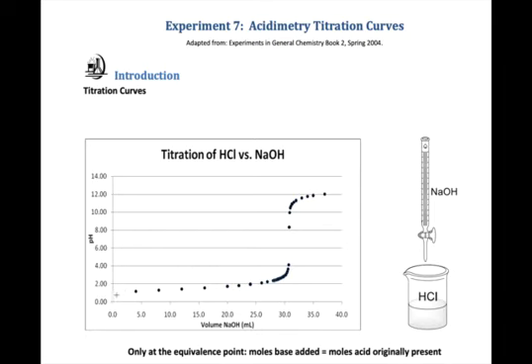So as we add sodium hydroxide to the solution, notice that the pH doesn't change very rapidly. We can add 4 mLs at a time, and we see very little change in the pH until we've nearly reacted all the acid. And then much smaller amounts of sodium hydroxide will give a much larger change in the pH, and the place where we're looking for an endpoint, that is an indication that our reaction is complete, is where the pH changes much more rapidly, the steepest place.